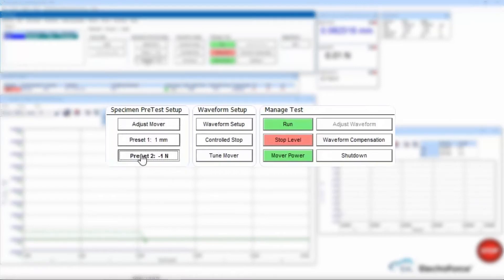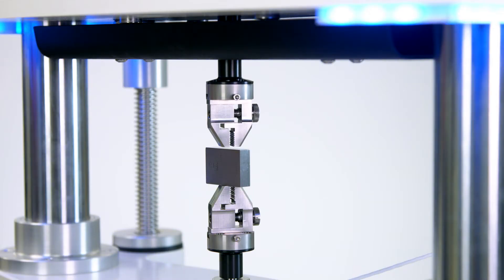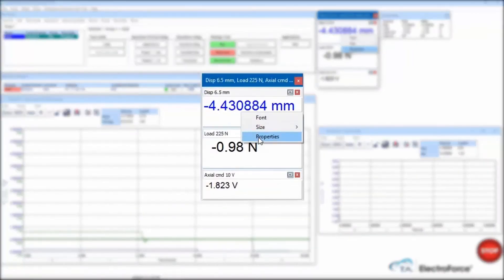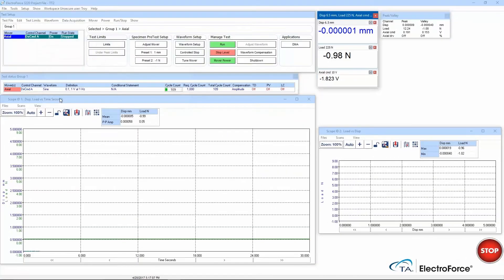I then use the preset feature in WinTest to move the grip to make light contact with the gauge block. Once I'm in contact, I will tare my displacement channel to zero using the auto tare feature. This displacement channel is now configured for the corrected sample height feature.